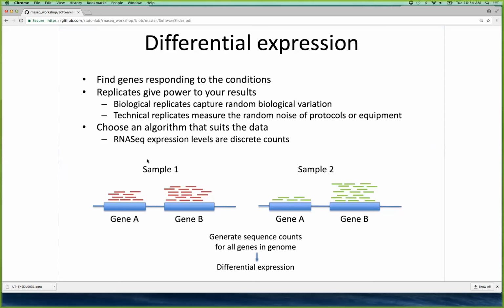Also, one important thing about RNA-seq data, mostly compared with microarray data or some other sort for measuring differential expression, is that it is digital data. That means you're counting reads. So you are getting 1, 2, 3 x thousands of reads. You don't have a continuous variable. So you need some specific software that is able to deal with this kind of data.